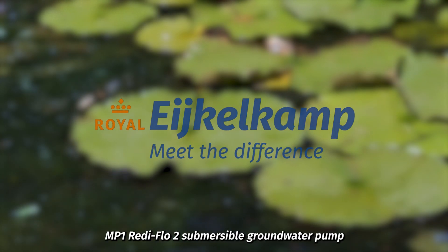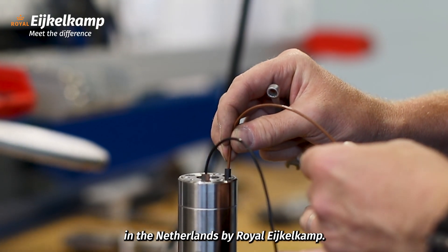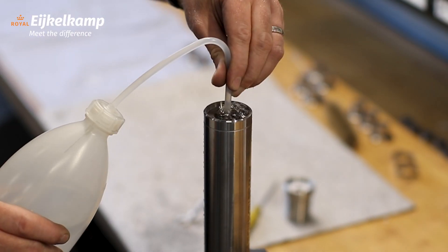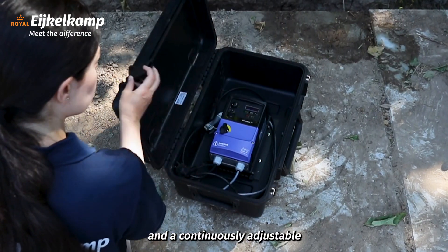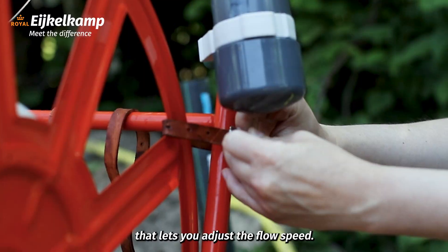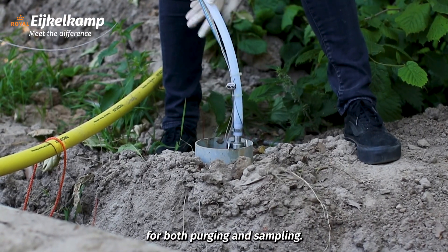Discover the MP1 Redi-Flo 2 submersible groundwater pump, exclusively manufactured in the Netherlands by Royal Eijkelkamp. This pump offers high head and a continuously adjustable frequency converter that lets you adjust the flow speed, making it a great tool for both purging and sampling.